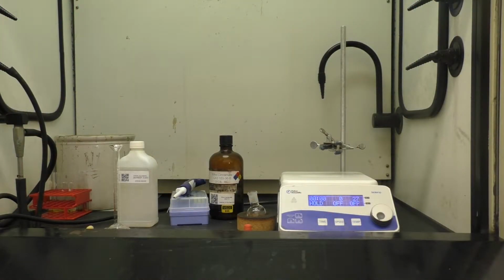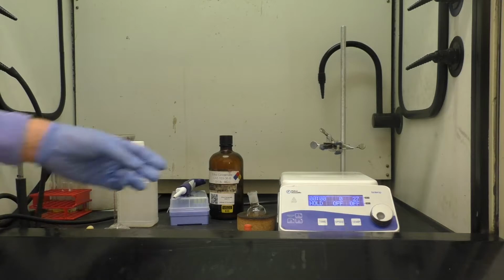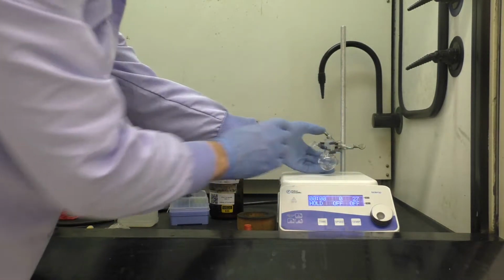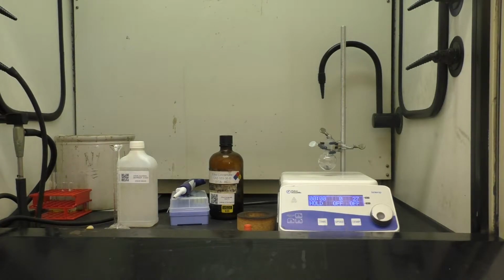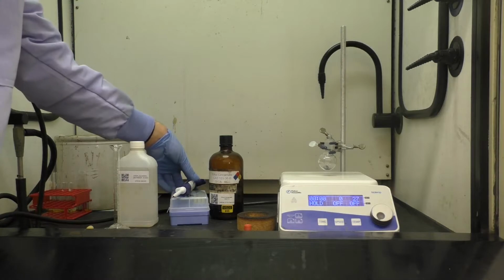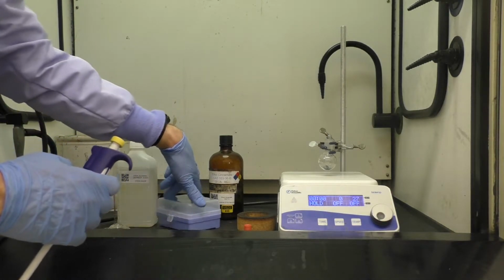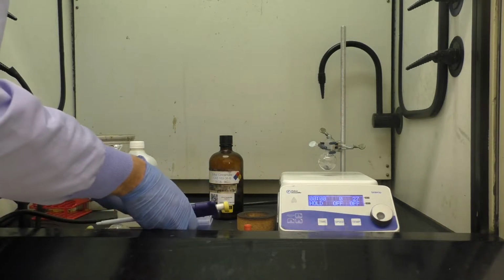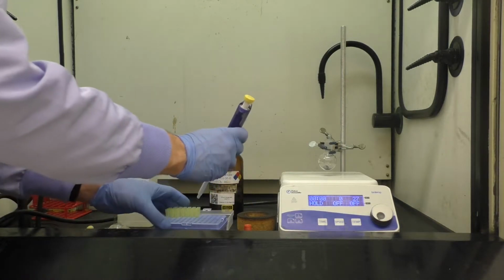We've now brought the reaction vial over into the hood to add the liquid reagents. So first I'll clamp my round bottom flask above the stir plate. Ensure that it is roughly centered. And then I'll go ahead and add my liquid reagent, ethyl cinnamate. I need to add 100 microliters with this micropipette.